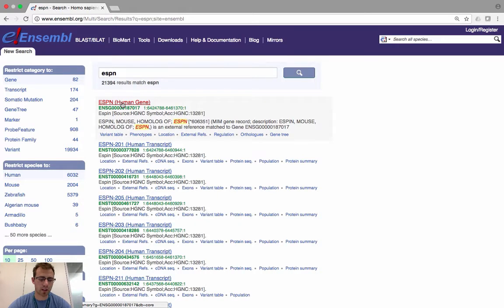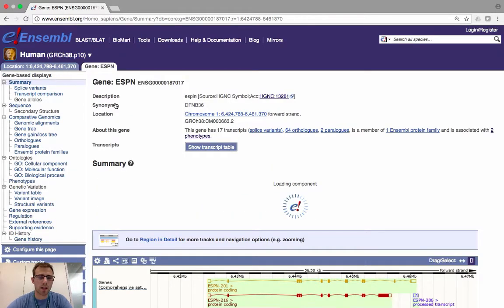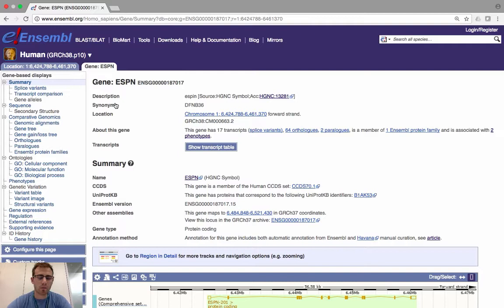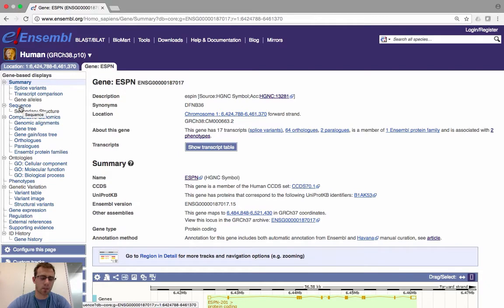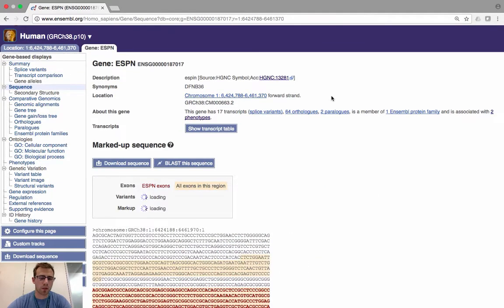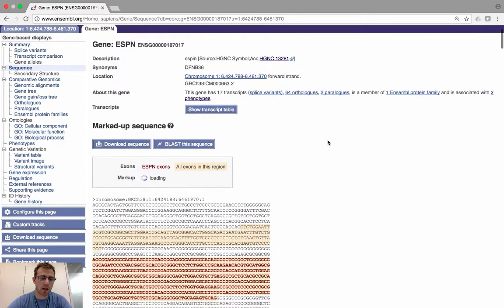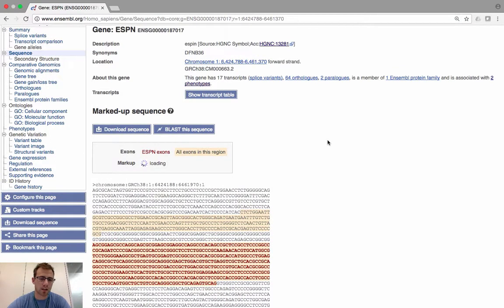We're going to find information about the ESPN gene in human, so click on this link and it will take you to the ESPN gene tab. Even from this page we can begin to find some information about the exon and intron sequences for the ESPN gene using the menu on the left-hand side. If you click on Sequence, when the page loads you'll see an annotated FASTA sequence that contains the ESPN gene.